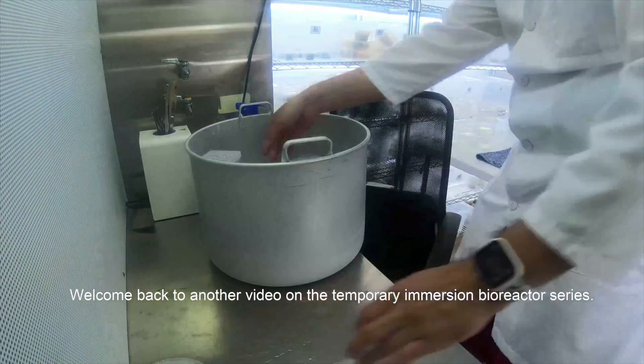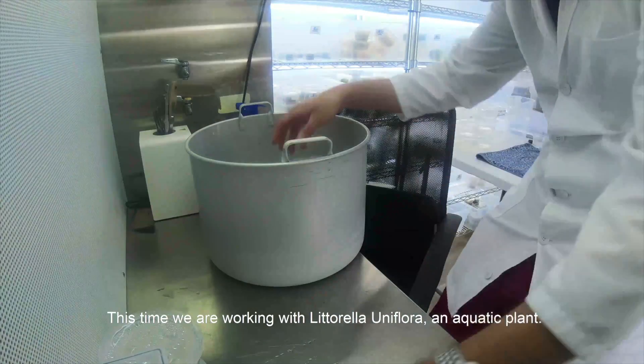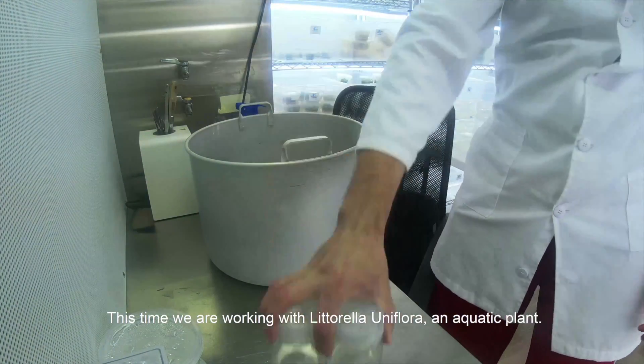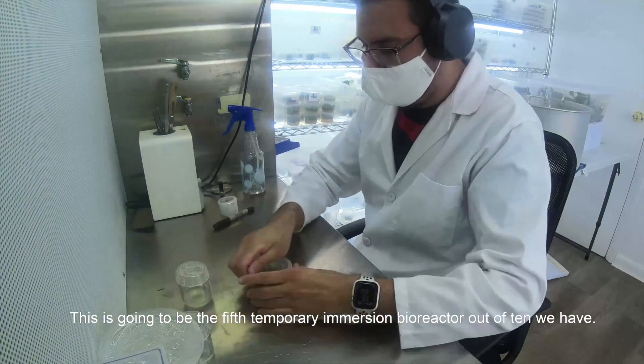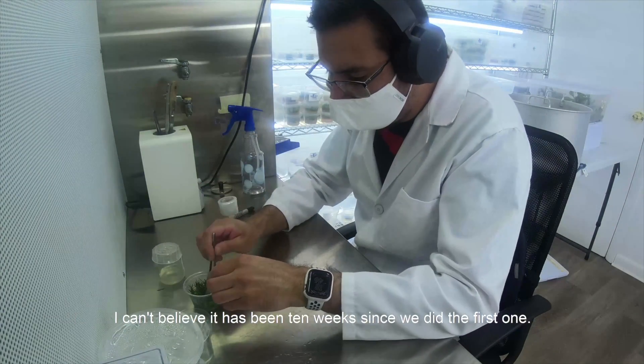What is going on guys, welcome back to another video on the temporary immersion bioreactor series. This time we are working with Littorella uniflora, an aquatic plant, and I need to start picking plants with easier names. This is going to be the fifth temporary immersion bioreactor out of 10 we have — I can't believe it has been 10 weeks since we did the first one.